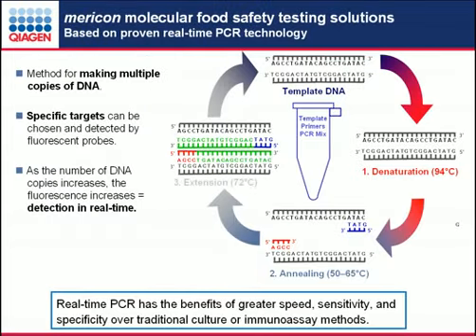And just a quick diversion here just to mention PCR. Certainly in the food arena, PCR is a newcomer to the detection systems. Mostly we've been working with culture in the past, immunological assays, but here we're talking about PCR.